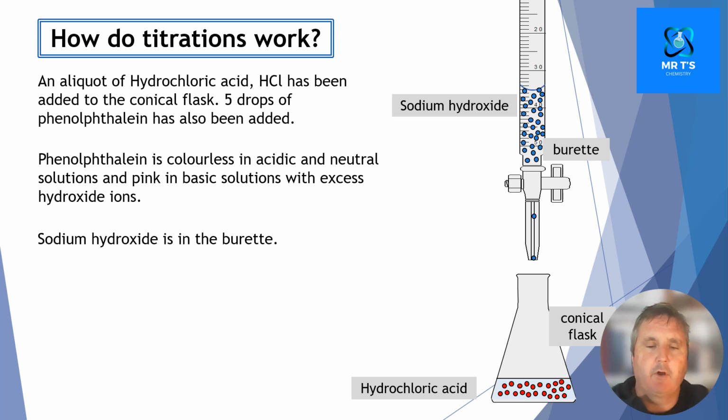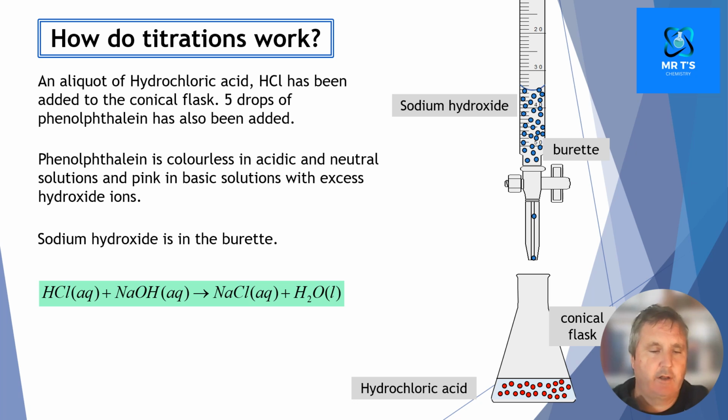In the burette, we've got some sodium hydroxide, a base, and you can see here from the setup, what we're going to do is add the sodium hydroxide to neutralize the hydrochloric acid. And of course, when that happens, it turns into neutral sodium chloride and water.